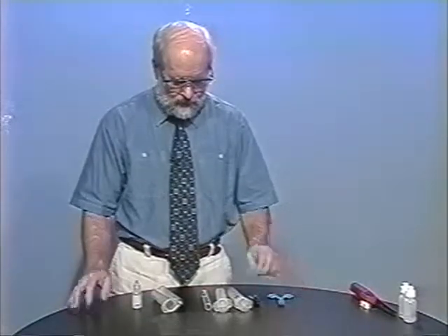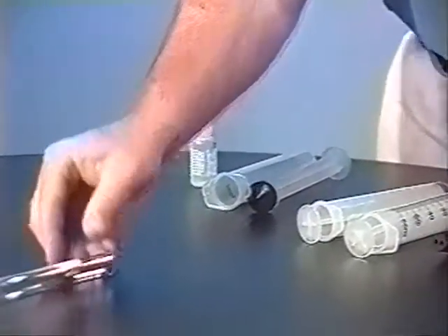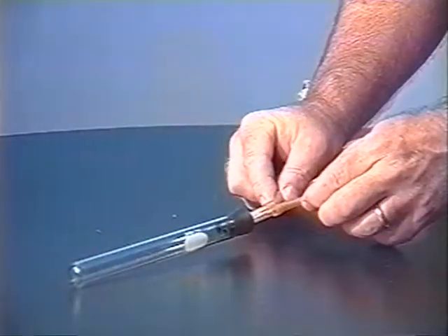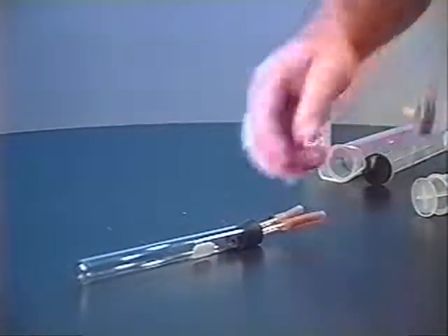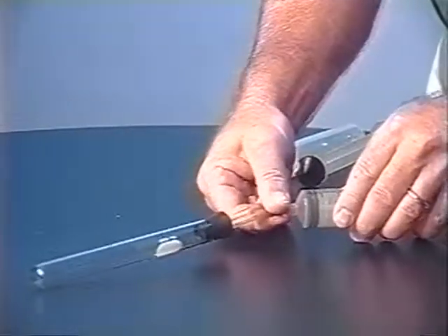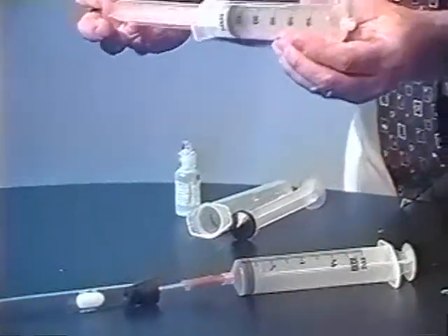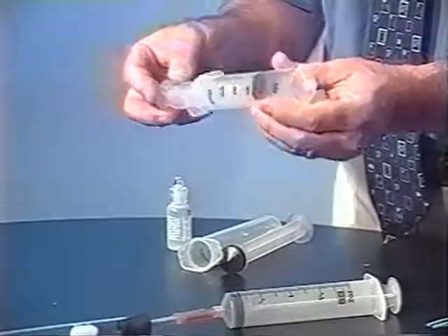This technique is slightly different. As a result, it uses a test tube, and to that we connect a rubber stopper with two glass tubes and two short pieces of latex tubing. To the latex tubing we connect two syringes.